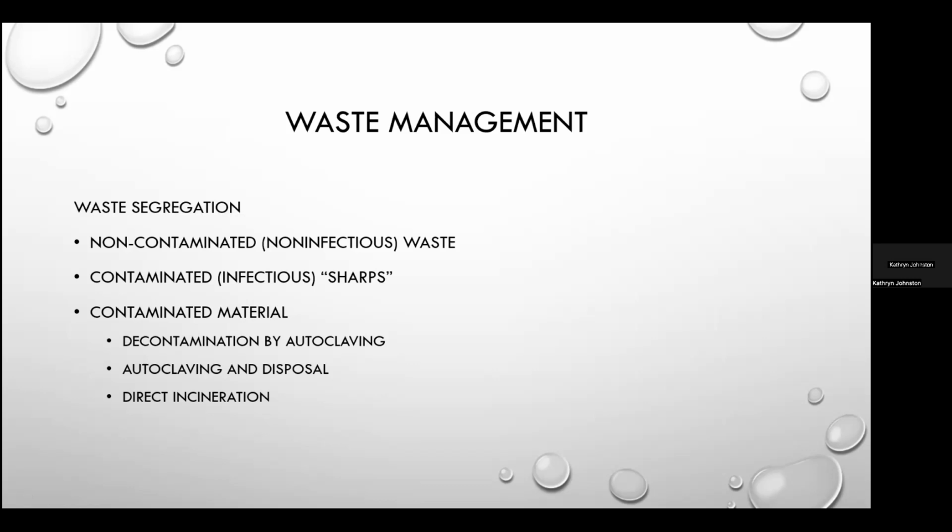Your contaminated infectious sharps include your hypodermic needles, your scalpels, knives, any broken glass that may be. And that's why with some of the pipettes and the Pasteur pipettes, you need to make sure. That's why it's important to have plastic whenever possible to prevent sharps injuries from broken glass. We talked about needles not being recapped, clipped, bent, or removed from disposable syringes. And then your containers for your sharps should be puncture proof and not filled more than three quarters full.